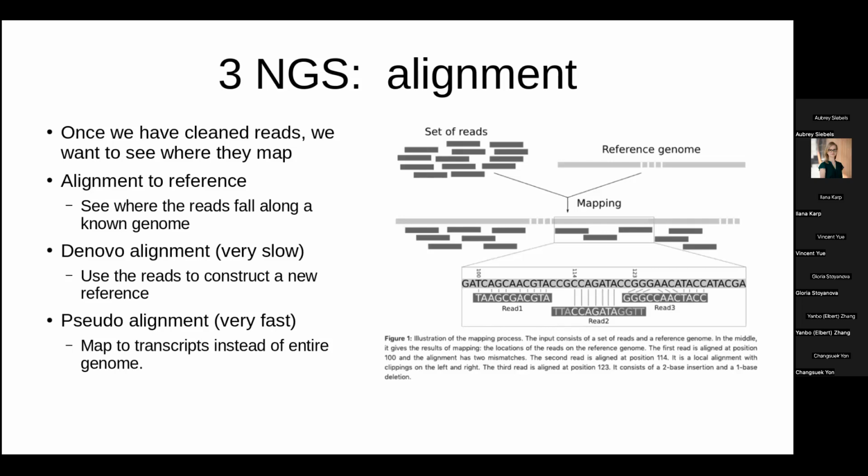So generally you use software or programs that have already been written and already been optimized. I prefer the STAR aligner or even BWA. There are probably 10 or 20 main aligners that people use. You generally don't want to do this yourself, but there are typically 3 ways to do this.